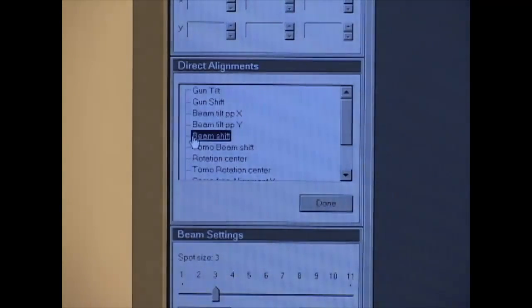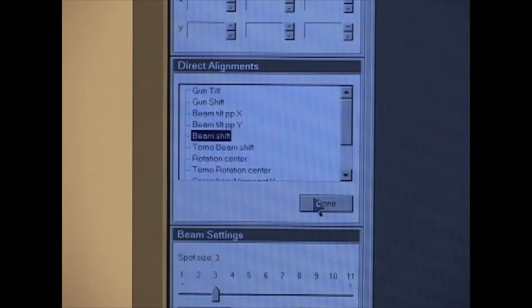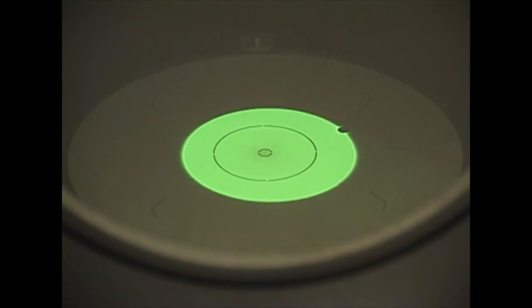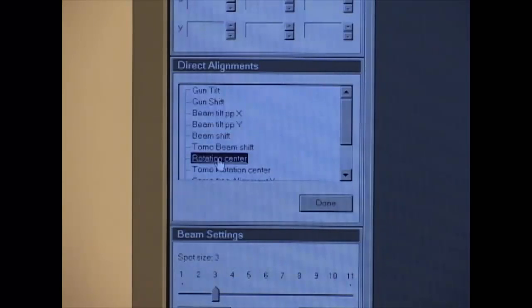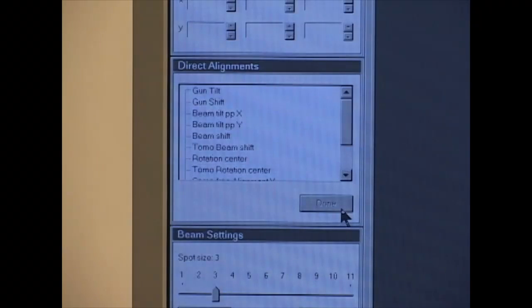Select Beam Shift and center the beam with the multifunction key, and then click Done. This saves the position of the beam so it can be recalled later if it gets lost. The trackball position cannot be saved. Select Rotation Center. The beam begins to wobble and the image moves. Adjust the multifunction dial until the movement of the image is minimized and the edge appears simply to go in and out of focus. Click Done to finish the direct alignments.